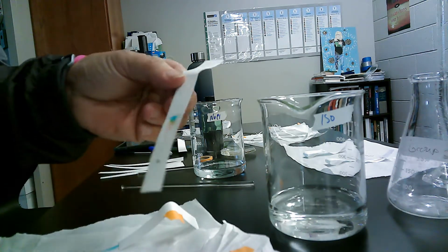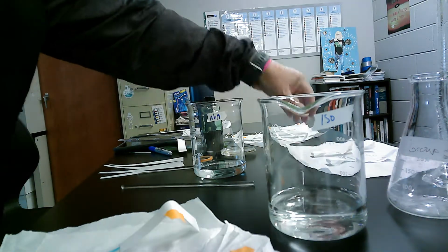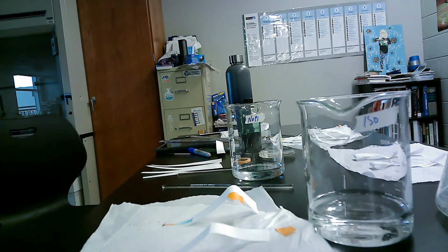So I have this, and then I'm going to let it sit and see the ones that we did before that I already showed you. And then once they dry, we're going to do the calculations. That'll be a different video that you'll see of how to do the calculations. But that is how we perform the chromatography experiment.